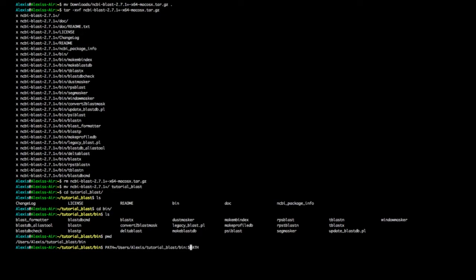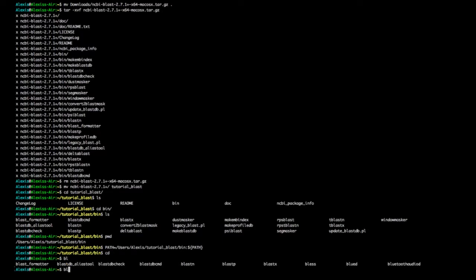Now I'll add it to my PATH. I have an old habit of adding tilde shortcuts, but you don't have to. Now that it's added to my PATH, I can be anywhere and just type 'blast' — and as you see, you have access to all commands starting with 'blast' that were in that directory.